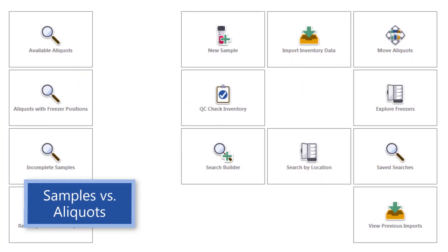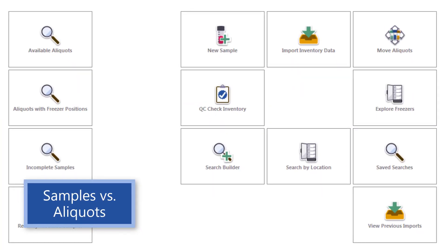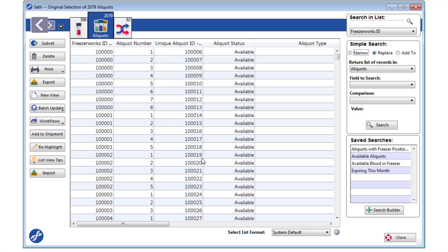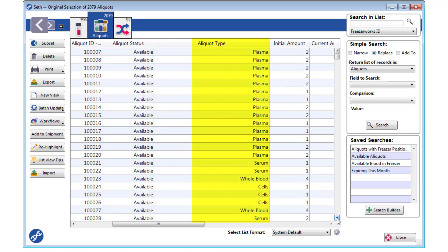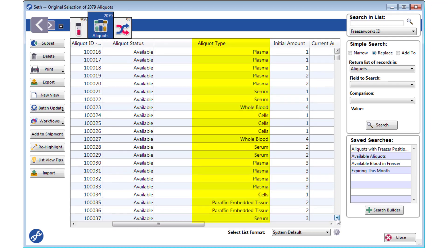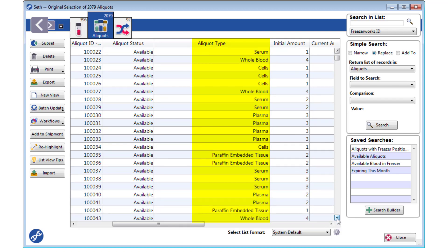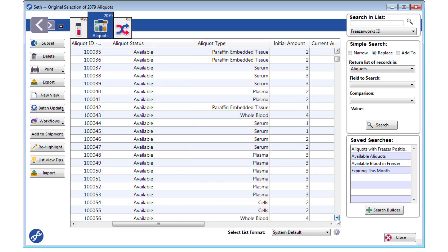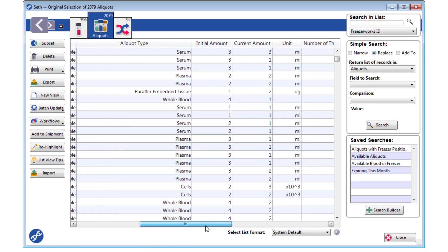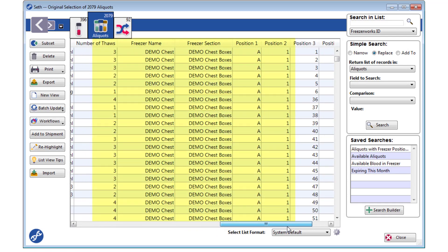If you've been using Freezerworks for a bit, or looked into the software at all, you've probably stumbled across the word aliquot more than a few times. The word itself means portion of a sample, and in the many different systems we serve, this portion can take on many different forms — a vial of serum or plasma, slides of saliva, DNA extraction tubes, wells in a plate, paraffin blocks, tissue cassettes, the list goes on and on. But in Freezerworks, an aliquot is always the thing that holds a position in the freezer.